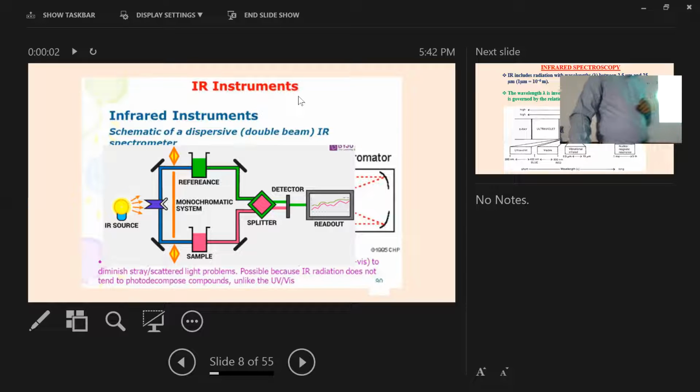Actually, that is not so expensive compared to several other optics, because we are just giving a very thin layer over the mirror. So for IR light, you need to use a gold mirror. That means it can reflect most of the IR light.